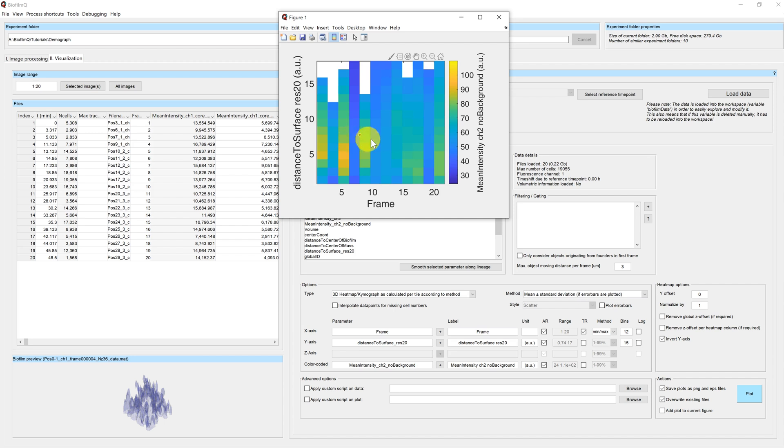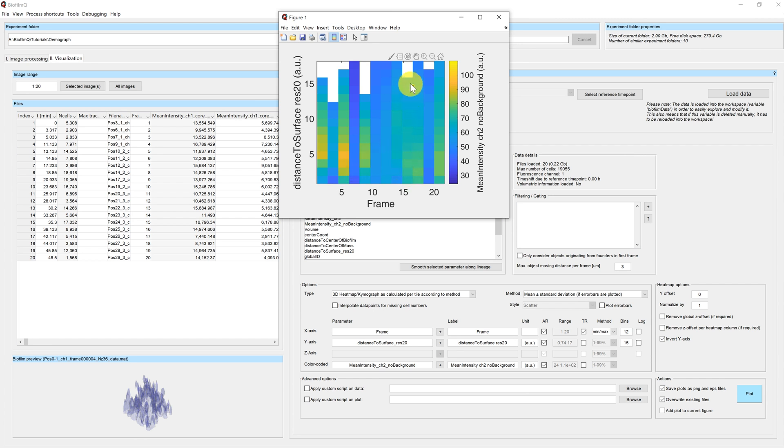So one of the different positions. And you can see in which biofilms the reporter is more or less active, and how this changes with the spatial distribution.